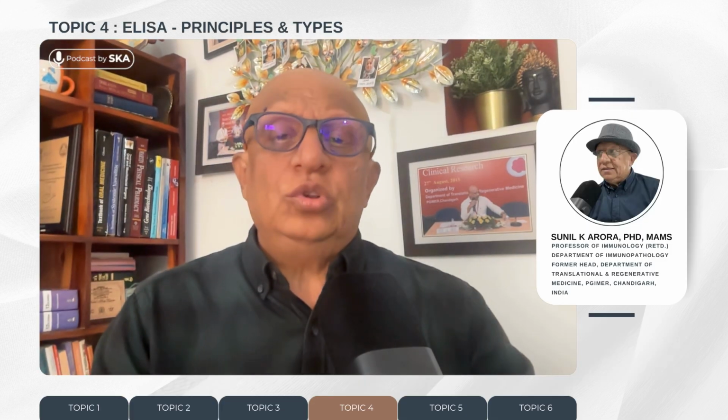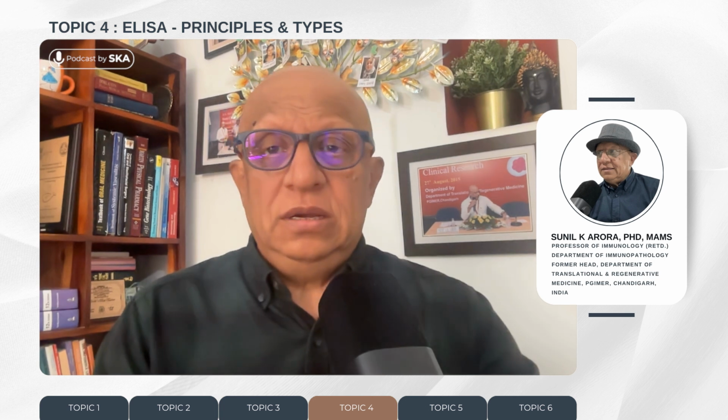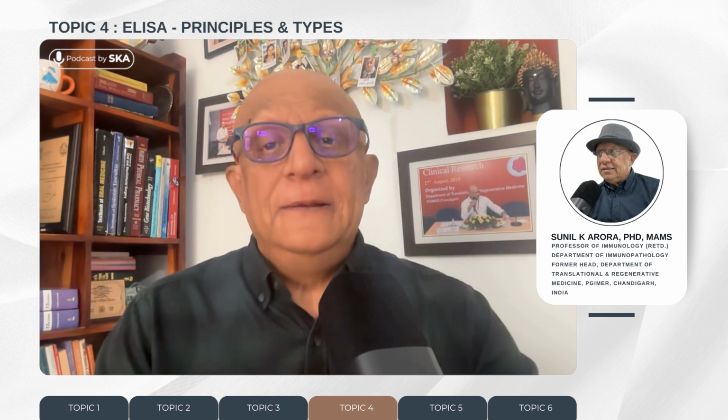Very nice. So the good thing is ELISAs are very sensitive, very specific, and quantitative in nature as well.